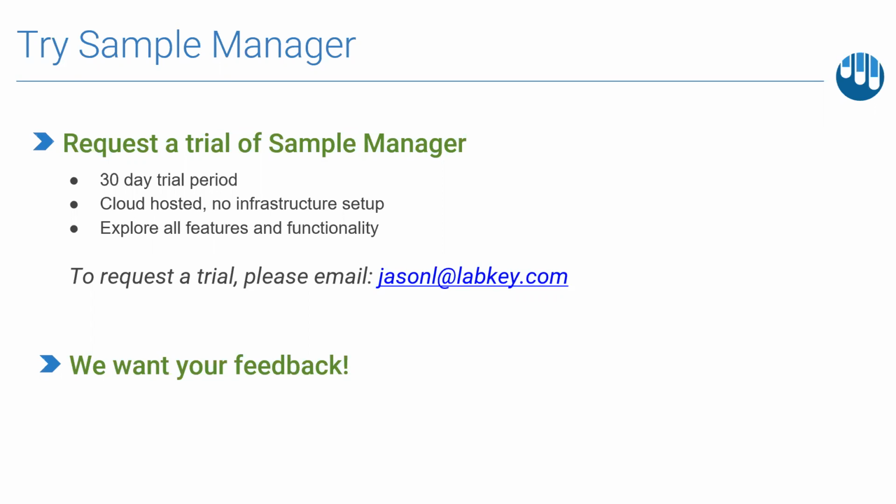It's important to note, we're very invested in delivering a needs-met sample tracking tool. It's something that our customers have been asking us to do for many years now. And the idea today was really just to provide you with the highlights of the features, the benefits, and the values that it could potentially bring, and to let you know that it's an evolutionary product that we're building out over time. And we're very excited, as I mentioned, to deliver barcoding and freezer management later this year. And really to ask for your help, your feedback, all good, all bad, we are all ears. We want to do a better job to make sure we build a tool that's appropriate to your requirements.